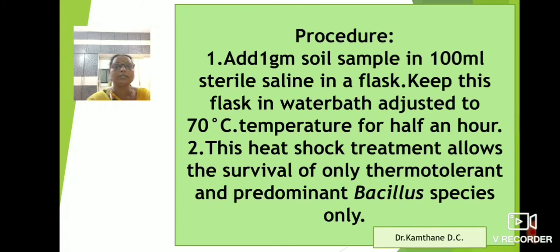Procedure: Firstly, add 1 gram soil sample in 100 ml sterile saline in a flask. Keep this flask in water bath adjusted at 70 degree Celsius for 30 minutes. This heat shock treatment causes the survival of only thermotolerant and predominant Bacillus species present in the soil while rest of the bacteria get killed due to this heat treatment.